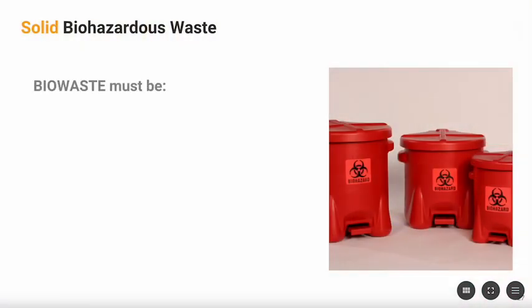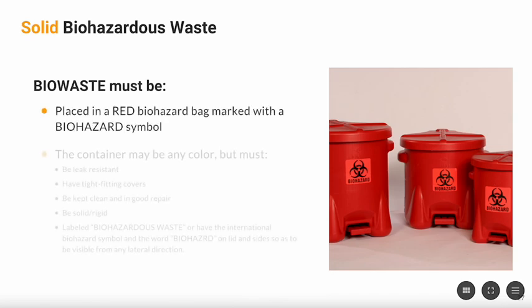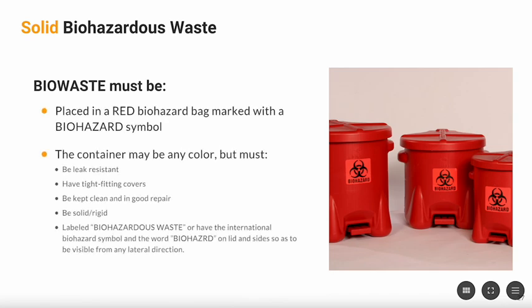Solid biohazardous waste, also known as biowaste, must be properly handled and disposed of to ensure the safety of laboratory personnel and the environment. Proper disposal of biowaste includes placing it in a red biohazard bag that is marked with a biohazard symbol. The container for the biohazard bag must be leak-resistant and have tight-fitting covers. The container must be kept clean and in good repair.